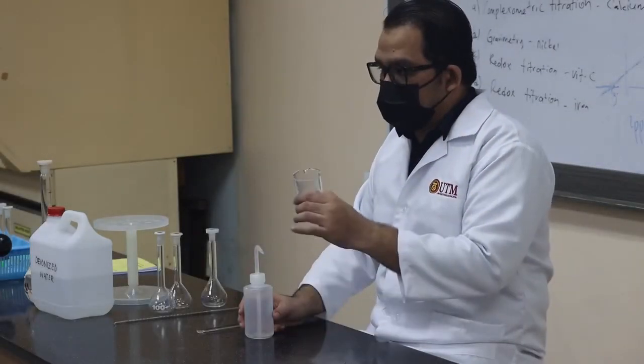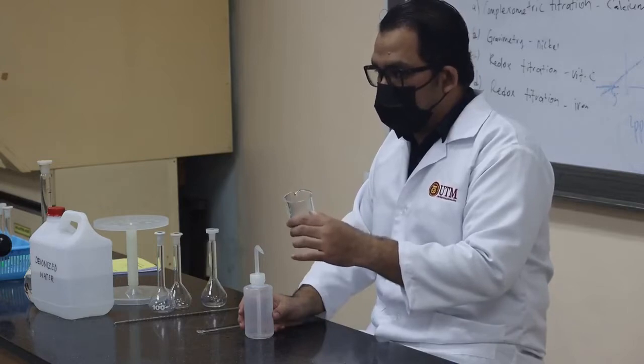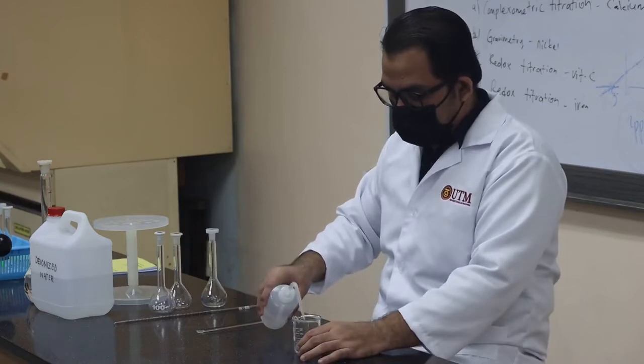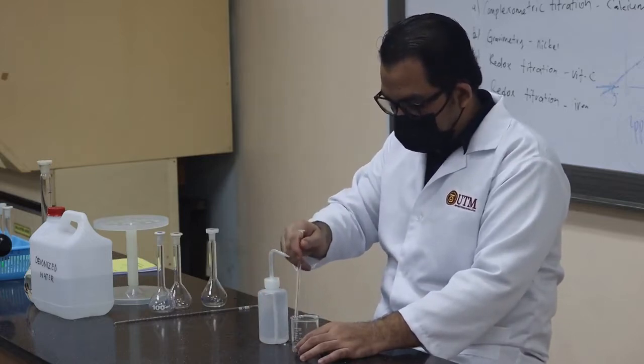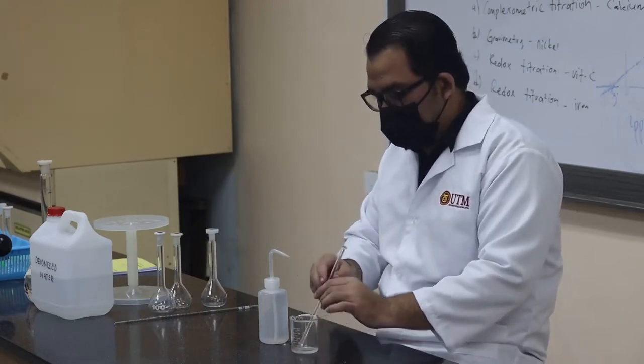The next step in this process is to prepare the solution. I am going to dissolve the 0.44 grams of zinc sulfate in 100 milliliters of deionized water. Stir it to make sure that it is homogeneous.